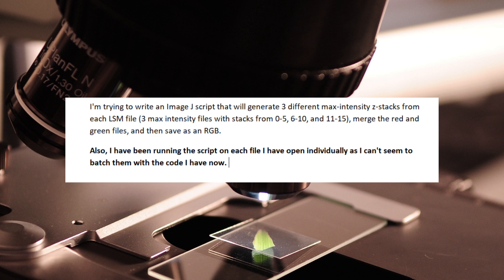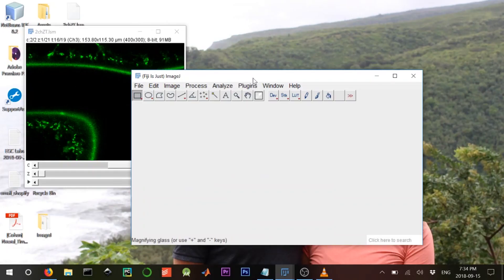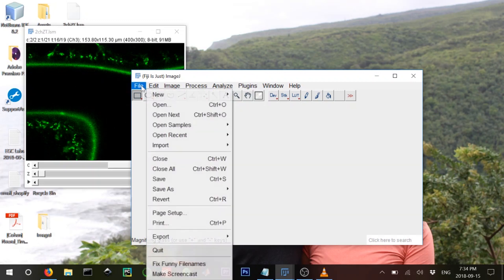That's what we're going to do. We'll first chunk the problem. The first step will be to make something that runs on multiple files, then progressively: take the file, generate a max intensity z-stack, generate it on three different stack ranges, merge the red and green, and finally save the whole thing as an RGB for every file.